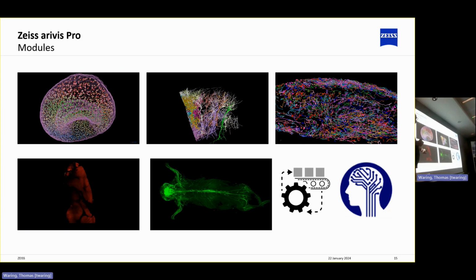The import of objects may be useful to the EM kind of team. This is if you already have segmented data sets, maybe from Microscopy Image Browser, where you've traced around manually, like you used to do in the old days, and built your segmentation data sets. You can still take those binary masks and drag and drop them into Arivis, and that will generate a 3D image already that you can then use to measure.